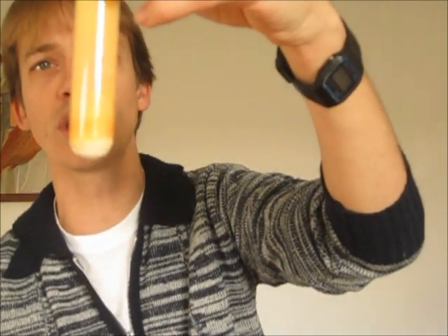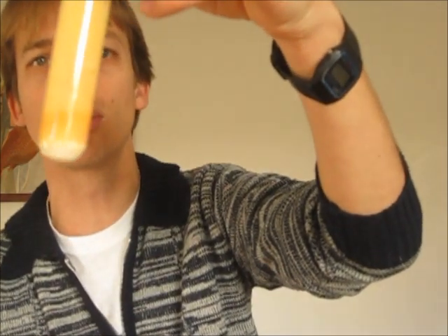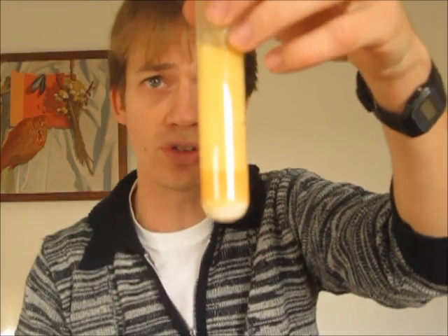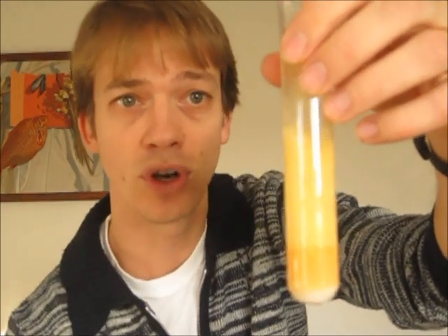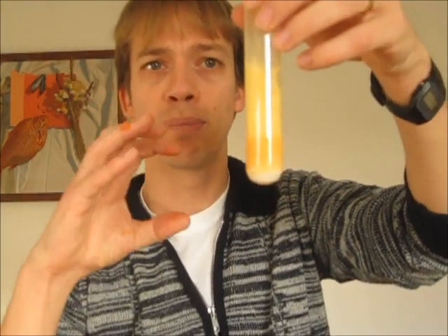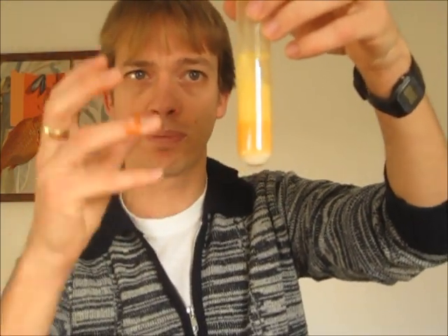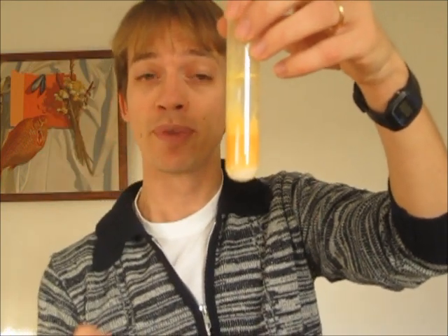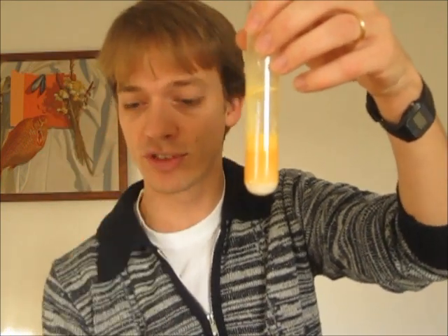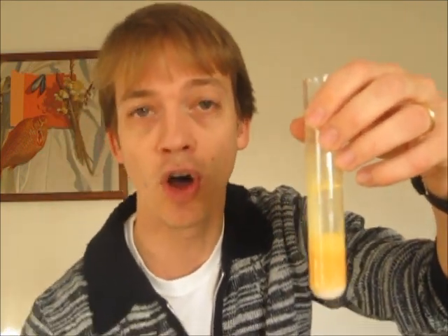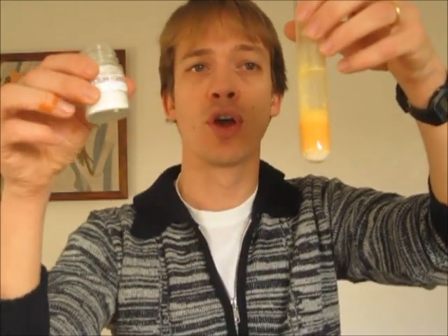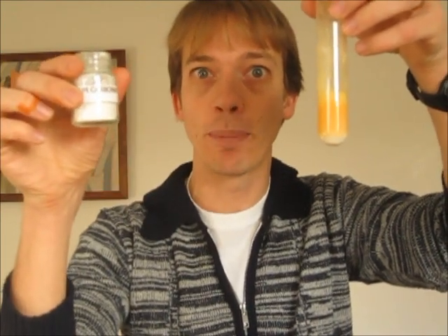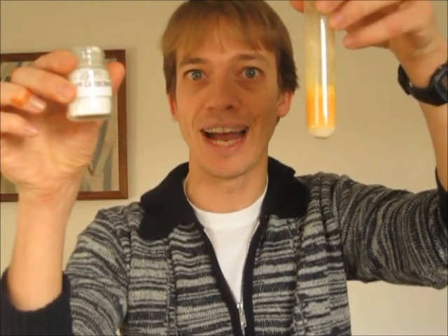It's changed colour — it's gone green, and I've seen lots of fizzing. It's gone green because it's gone to pH 7; it's become neutral. And it's fizzed because carbonates, when they react with acids, release carbon dioxide gas.